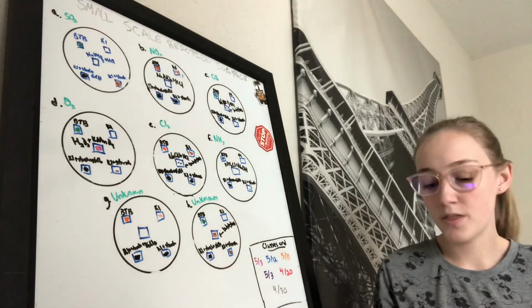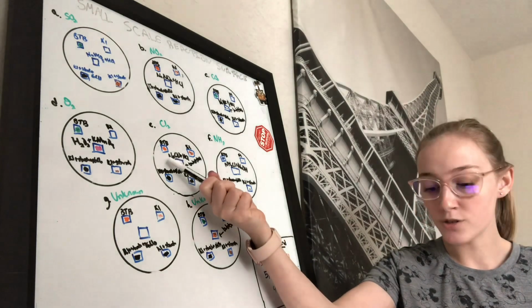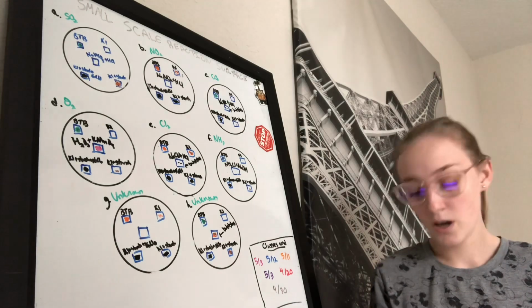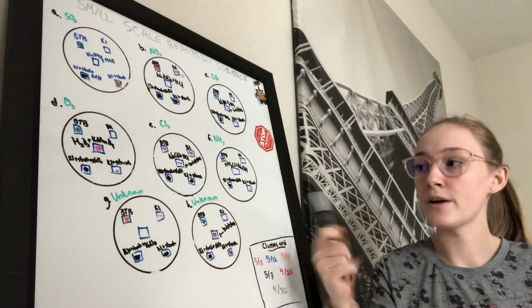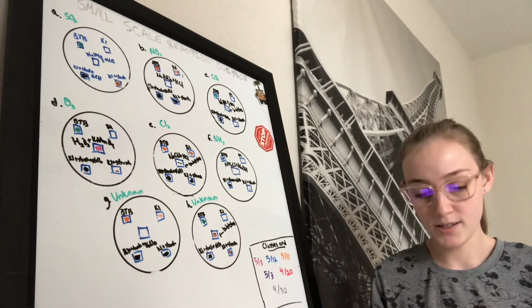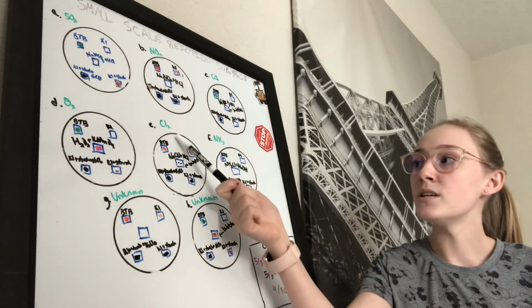So with reaction number E, which is NaClO plus HCl, you have the BTB changed into a yellow-orange. You have the KI change into a dark yellow-orange color with a little bit of brown in there. And then you have bubbles in the middle after it was mixed. And then you have the KI plus starch turned into a dark black, and the KI plus starch plus NaClO also stayed the same as that dark black, which comes to the conclusion that it's Cl2.